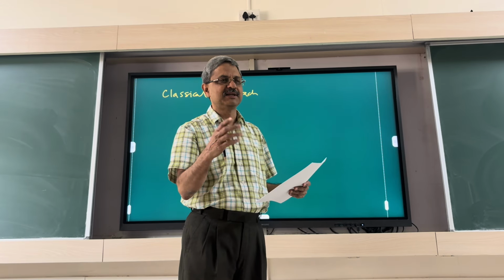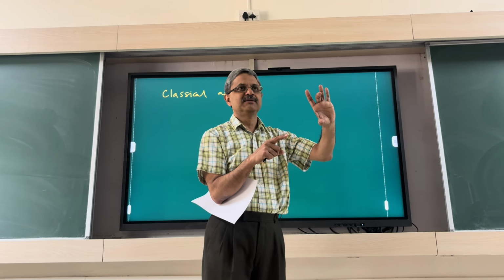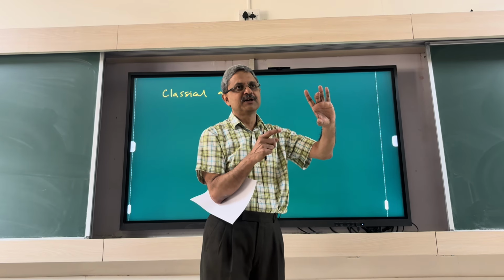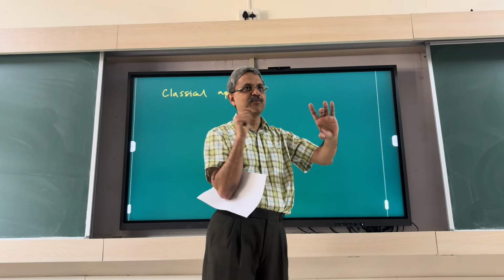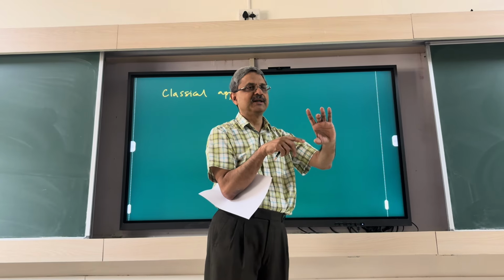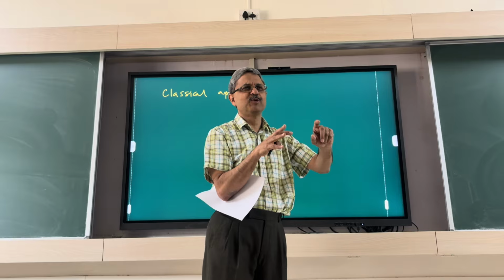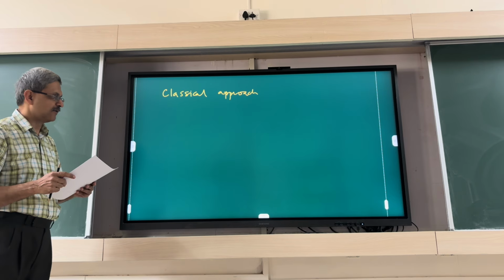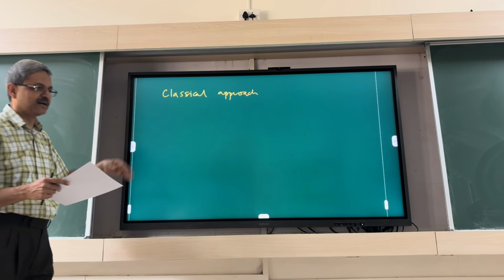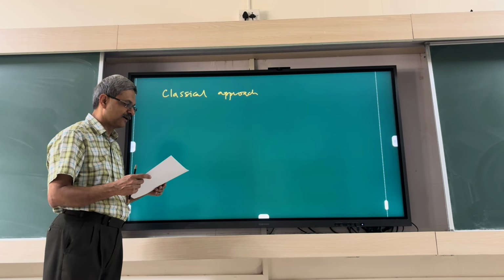Do you vary the frequency? You have an energy level difference which depends on H0. Let's say H0 is fixed. To observe a resonance, I need to change the energy of my RF somehow, so I need to change the omega of the RF. Is that what is done? How do we do it? I'll talk about what was done in the early classical days, and how that changed because of new instrumentation.